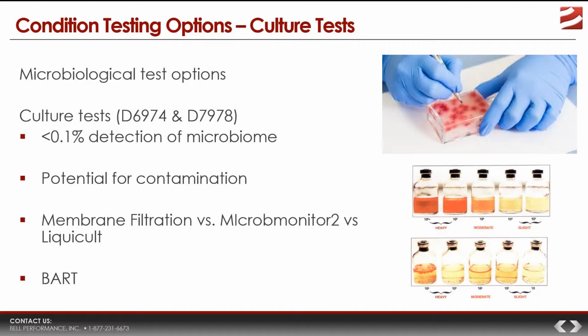Now, individual microbes are way too small to be seen by the naked eye. In order for a colony to be visible, it has to have about 1 billion cells in size. So if you see a little moldy spot on your bread, you probably got 1 to 10 billion fungus cells on there. So it takes 1 billion cells for a colony to be visible.